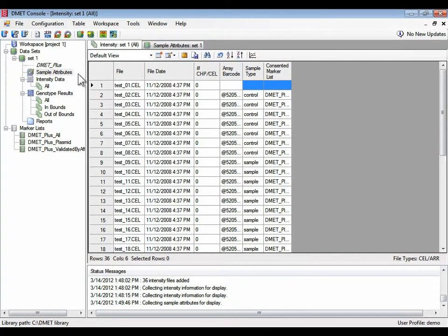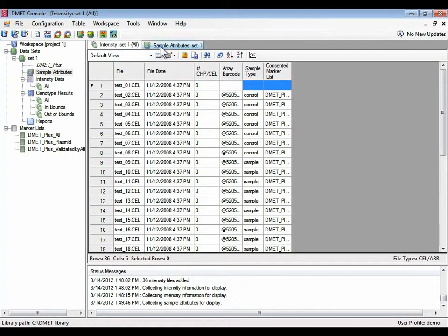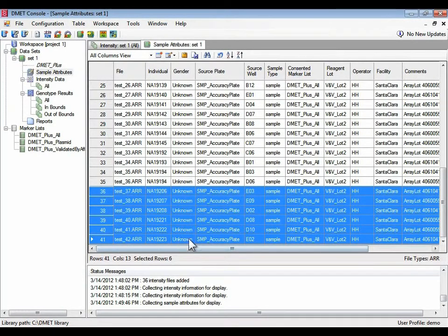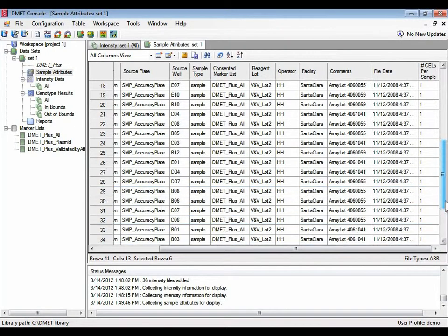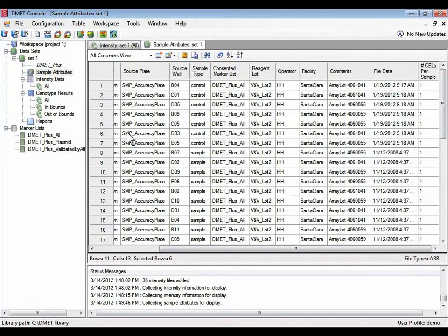But the first step whenever you're importing data is always make sure that you have all the cell files that you expected to have, you have all the sample files that you expected to have, and that there's a one-to-one match. So for every ARR file, you have one cell file. You want to make sure your data set is complete before you do additional processing on it.